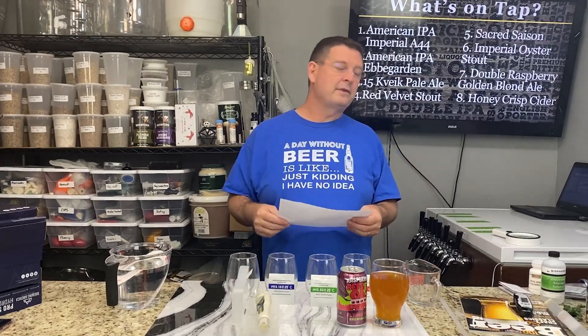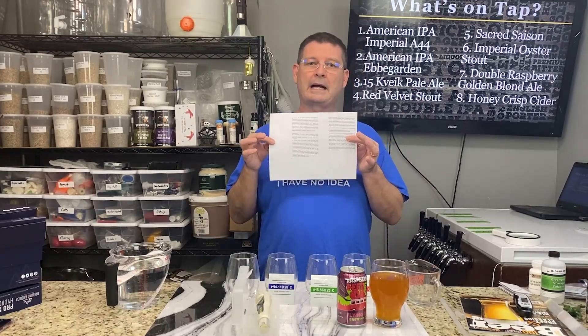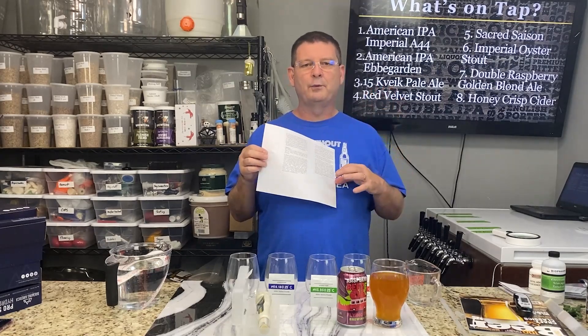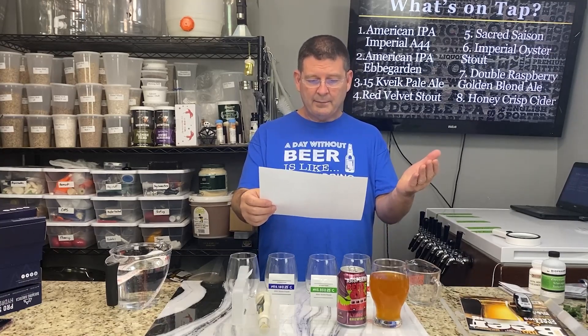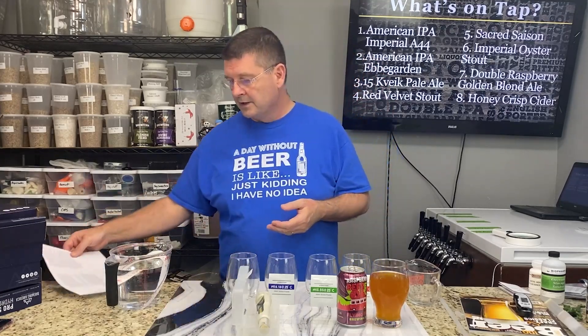So I sat down and read the instructions with a magnifying glass, then blew them up on my copier. Specifically, it says to do a three-point calibration and tells you exactly what to do. I'm going to show you the correct way to calibrate this thing so you don't have the headache I had.